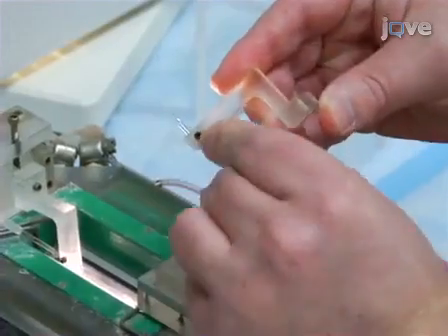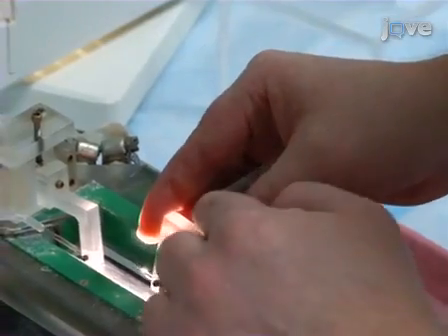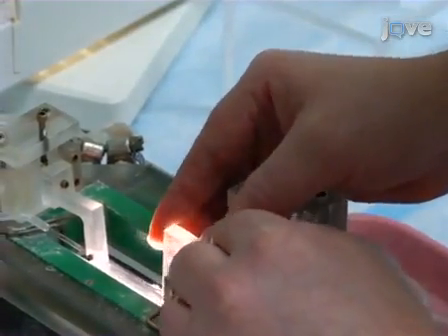Place 2 micropipettes in opposition into the pipette holders for the microvessel chamber, orienting them so that the tips are in the same vertical and horizontal plane within the vessel chamber.